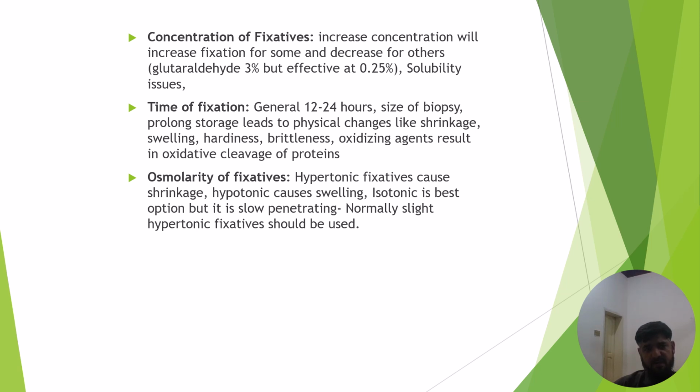Time of fixation is also one of the factors that affect fixation. Generally, 12 to 24 hours is used for fixation, but a large biopsy will prolong the time of fixation, and it can also cause physical changes like shrinkage, swelling, hardness, brittleness, and if oxidizing agents are used, it will result in oxidative cleavage of the protein.